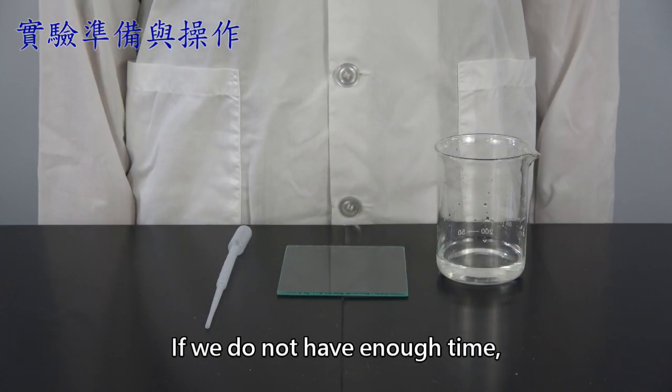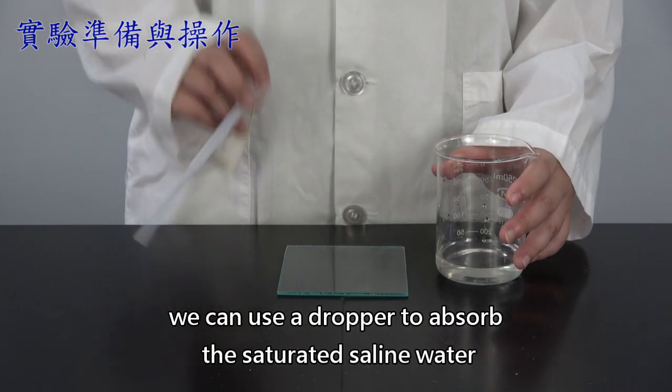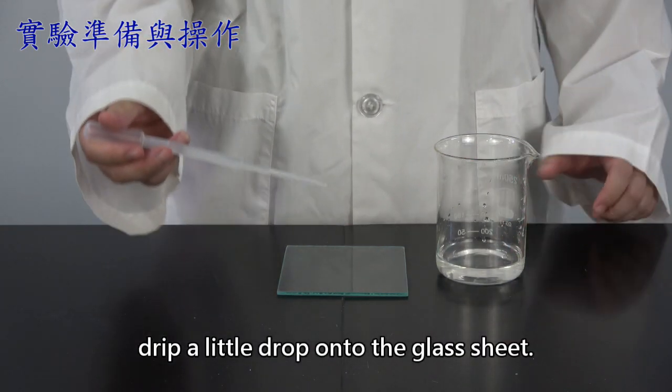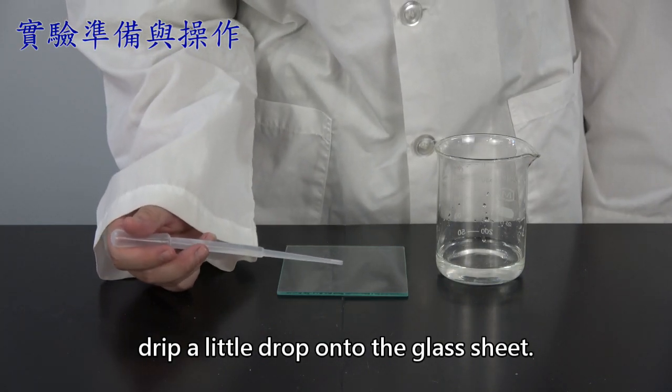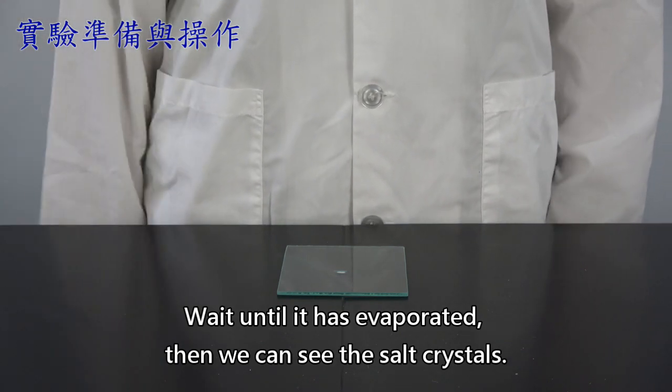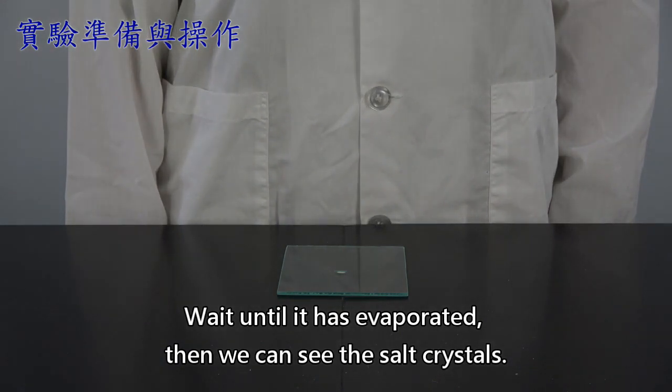If we do not have enough time, we can use a dropper to absorb the saturated saline water and drip a little drop onto the glass sheet. Wait until it has evaporated, then we can see the salt crystals.